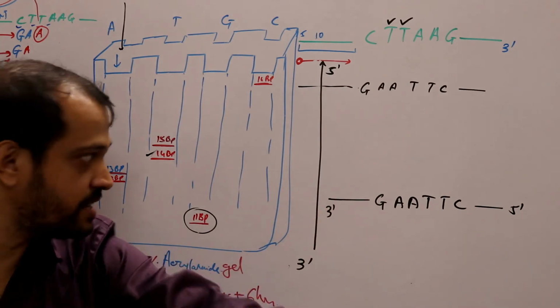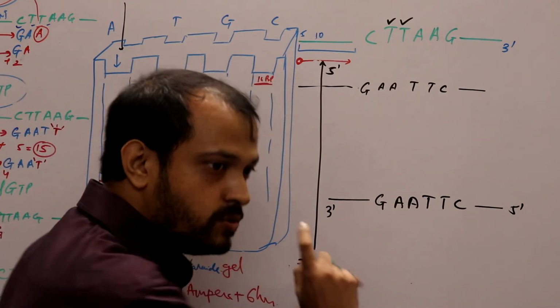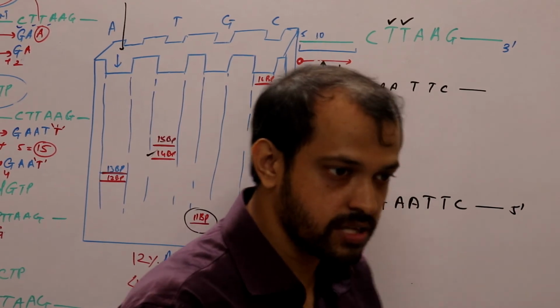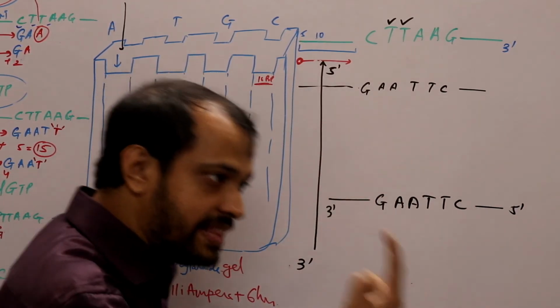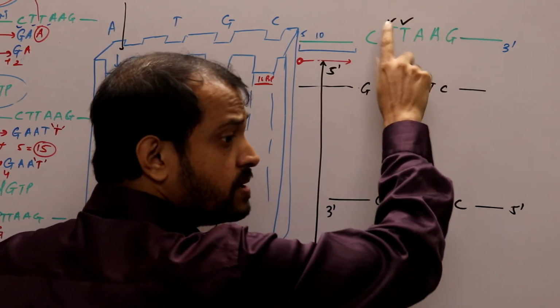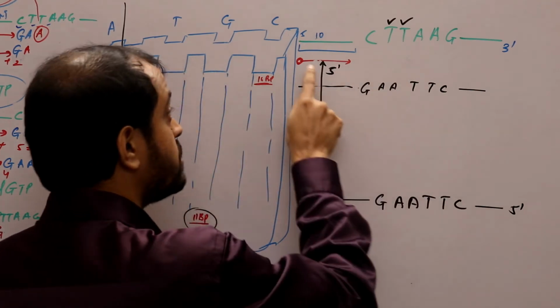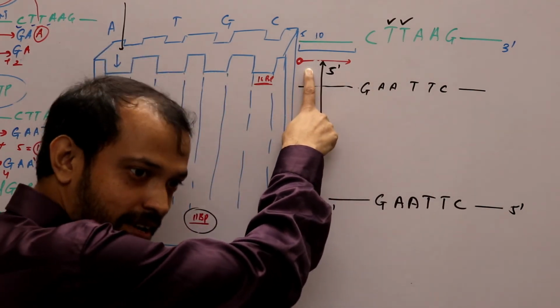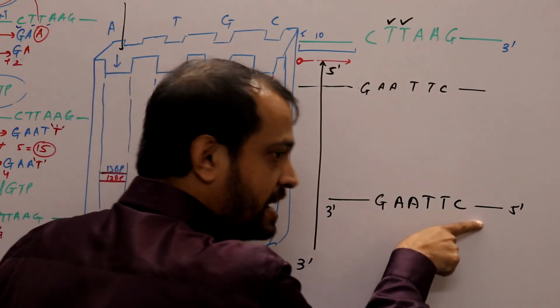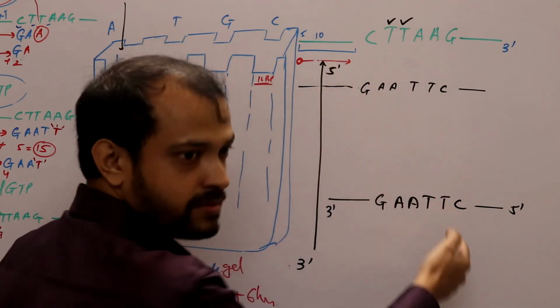Now don't write. Now listen. You will always have to understand that using Friedrich Sanger sequencing or dideoxy sequencing, you will always get that particular sequence for which you have used the primer. Again, another thing, the direction in which you are getting the sequence is opposite to the direction of primer, right?